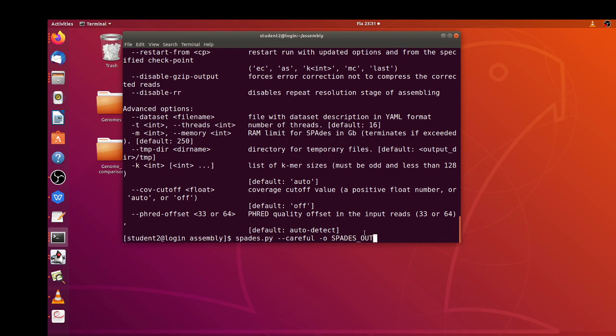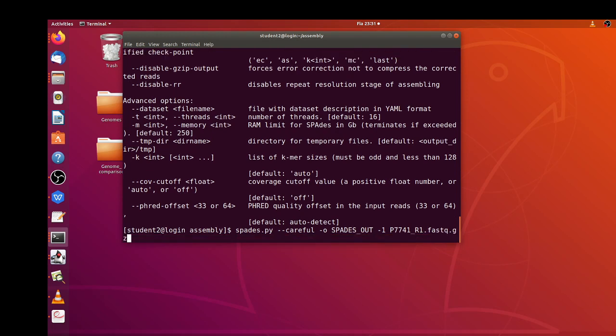Now let's add the paired-end. So -1 we add read one or the forward of the data, and then -2 adds read two or reverse. Okay, so now we can proceed.